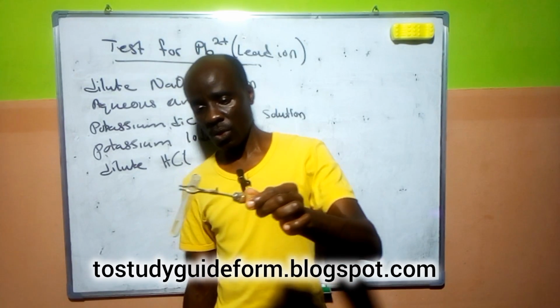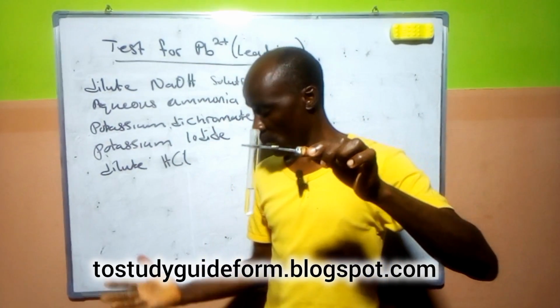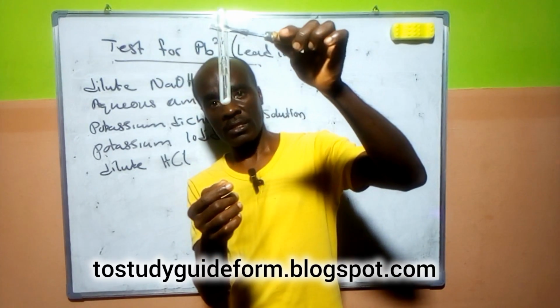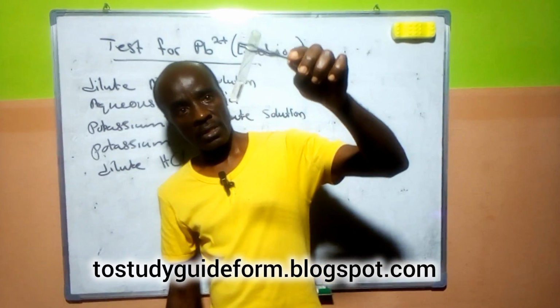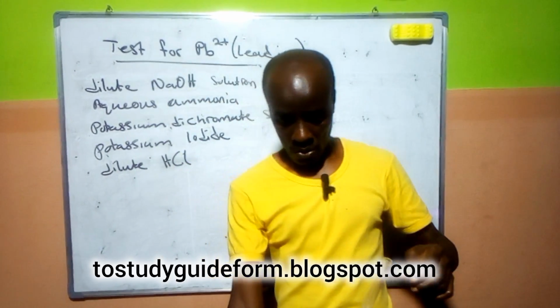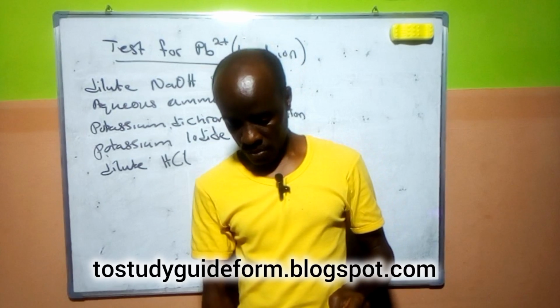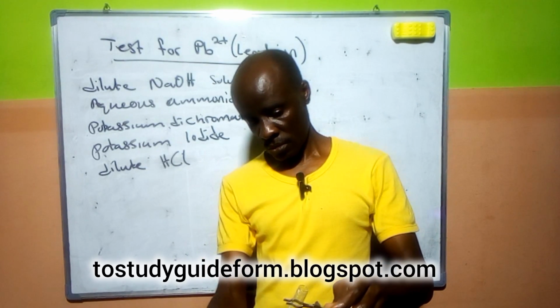What I will do is allow it to cool. When I allow it to cool, the precipitate will appear more. Look at it. It's clearing, it's dissolving gradually. But I won't continue this heating because of the time. So let me allow it to cool a little so that we'll see exactly what is going on.